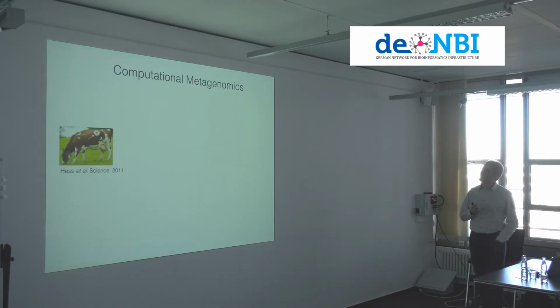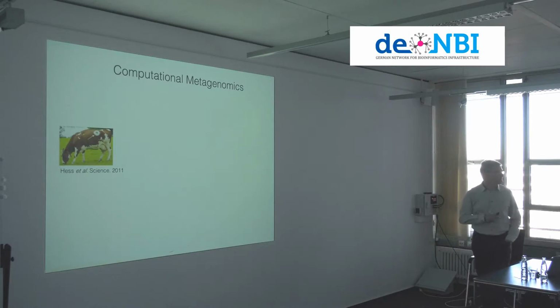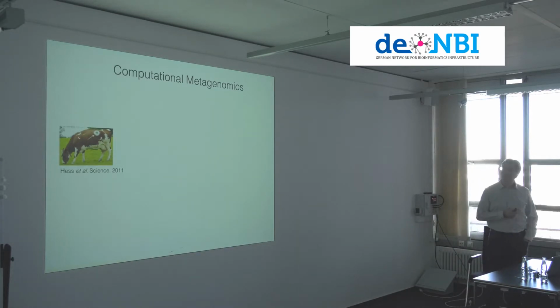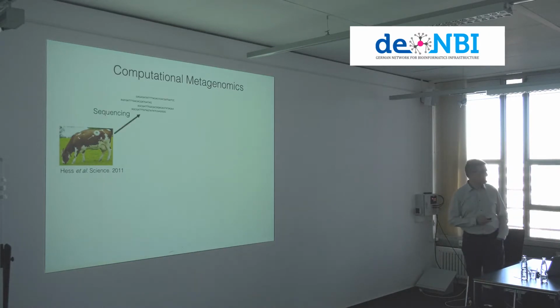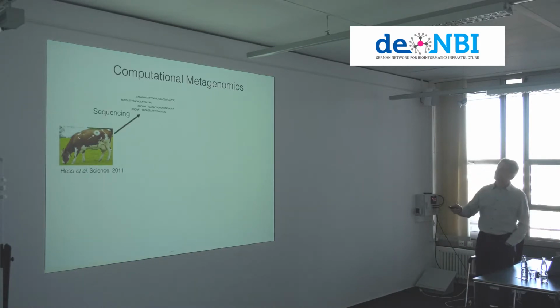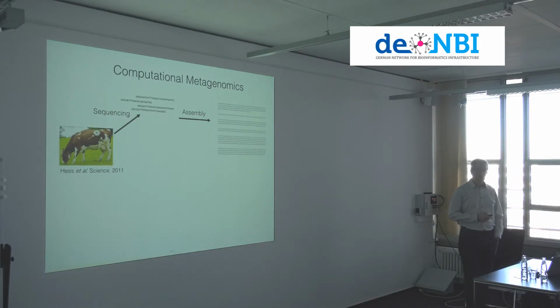But of course you can also do metagenomics, like a whole genome shotgun metagenomics approach, when you want to reconstruct these genomes, right? So now what you do is, again, you take your metagenome. This is a different study here, but anyway, you take a metagenome from some environment and start sequencing the DNA, right? Just random pieces of DNA, pretty short pieces. And then you do what's called an assembly, and you end up with longer stretches.